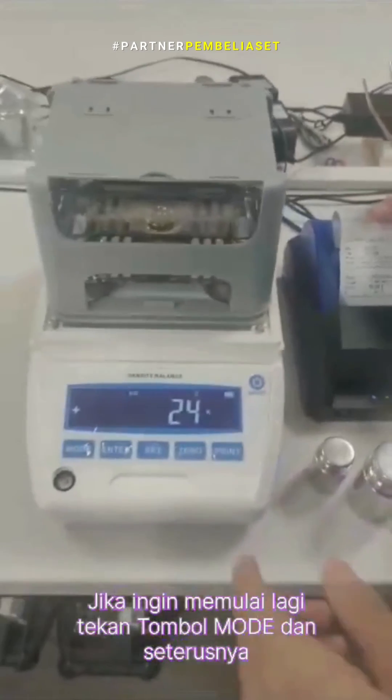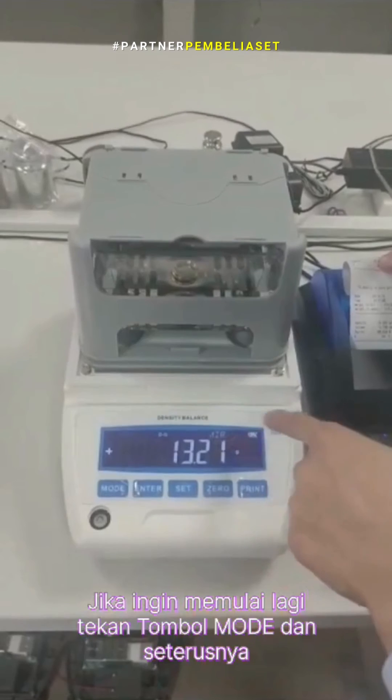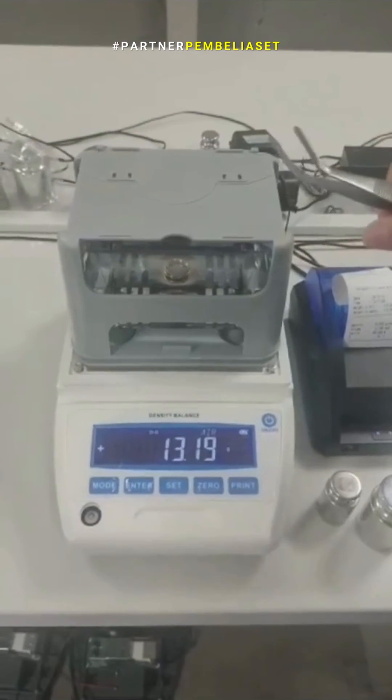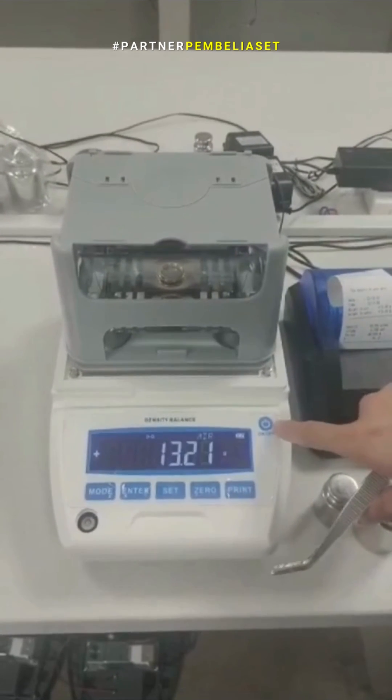If you need to test again, you can press the mode — this is L — to test another. If you don't need to test, you can short press on/off.